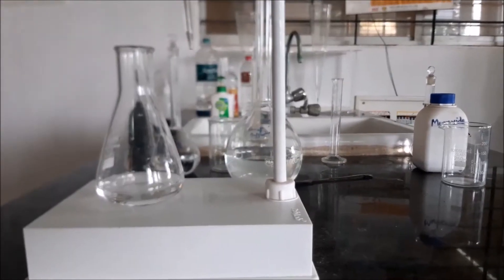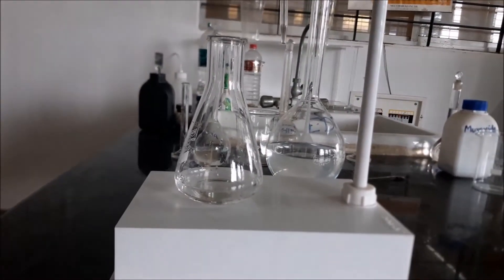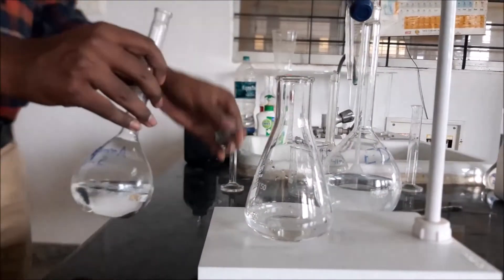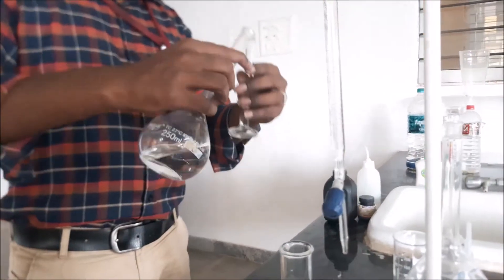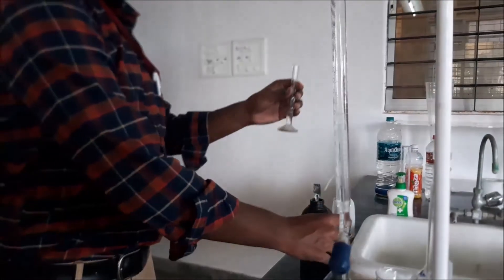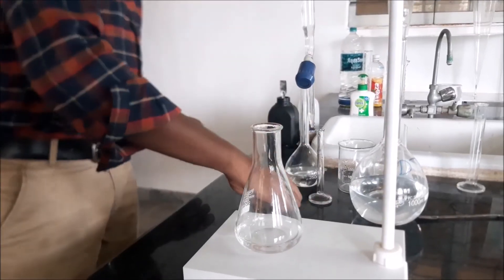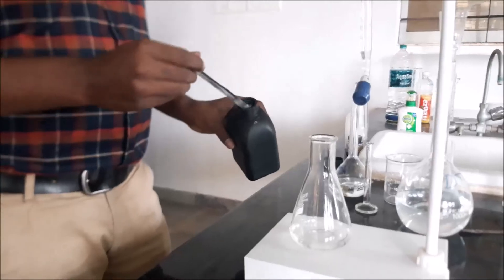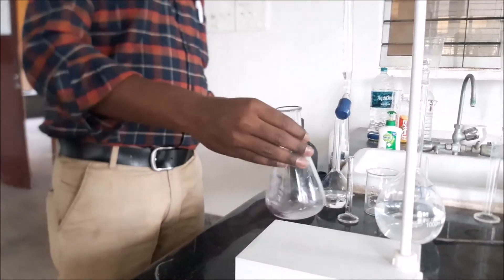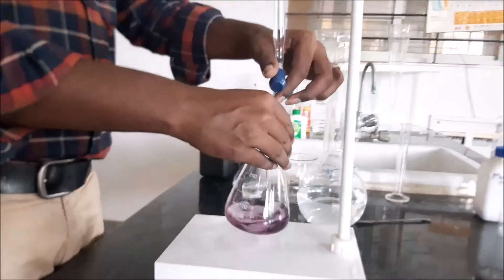In connection with the previous video, the same procedure has been carried out for 50 ml of distilled water in order to calculate the A1 value for calculation purposes. 2 ml of ammonium buffer solution is added to the sample, followed by a pinch of Eriochrome Black T indicator. The colour has changed to wine red and it is being titrated against EDTA.